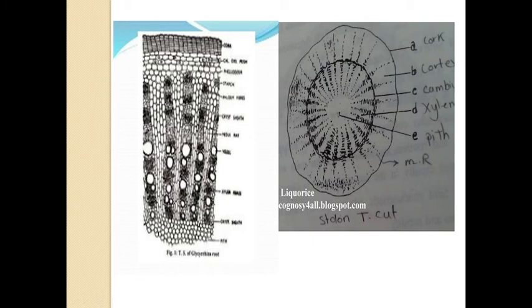Small groups alternating with bundles of wood fiber. This one is the wood fiber or xylem fiber, which are resembling the phloem fibers. They are also lignified and in the form of bundles enclosed in the parenchymatous sheath, which contains calcium oxalate crystals. The xylem parenchyma are lignified, having lignified pitted walls.